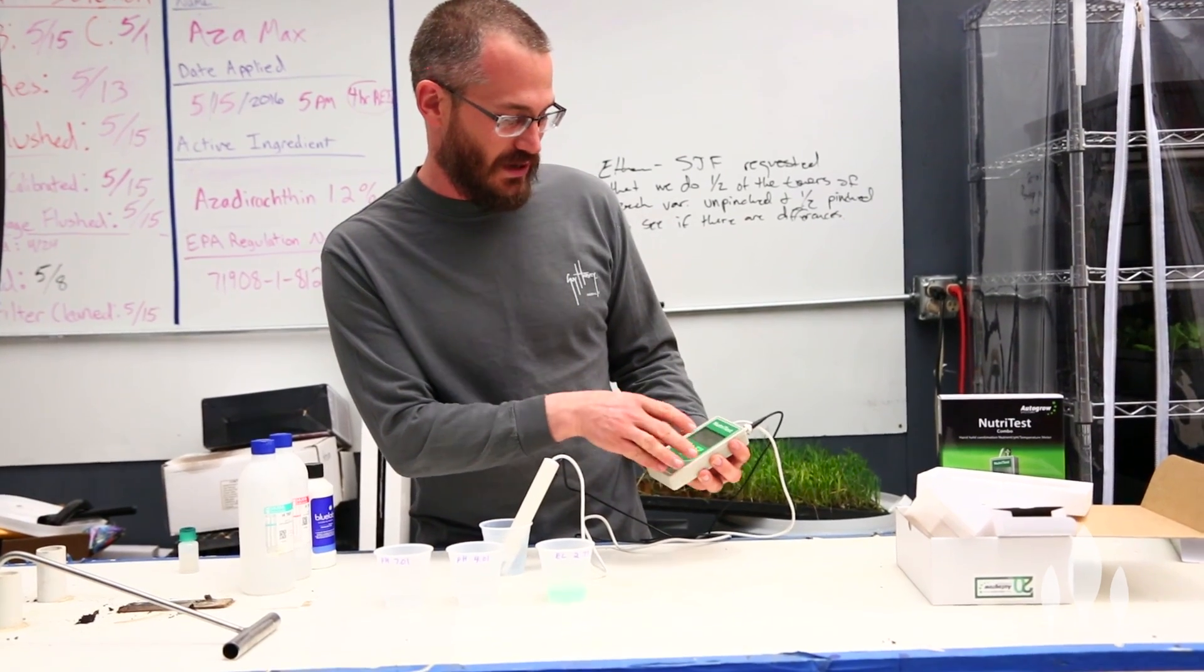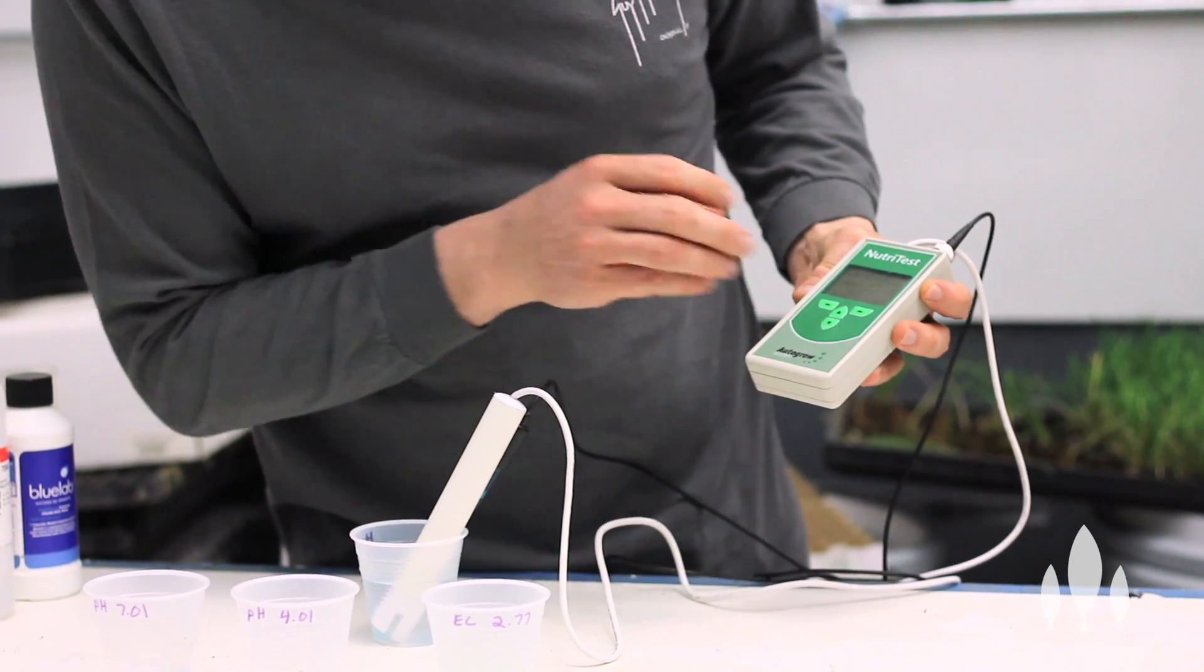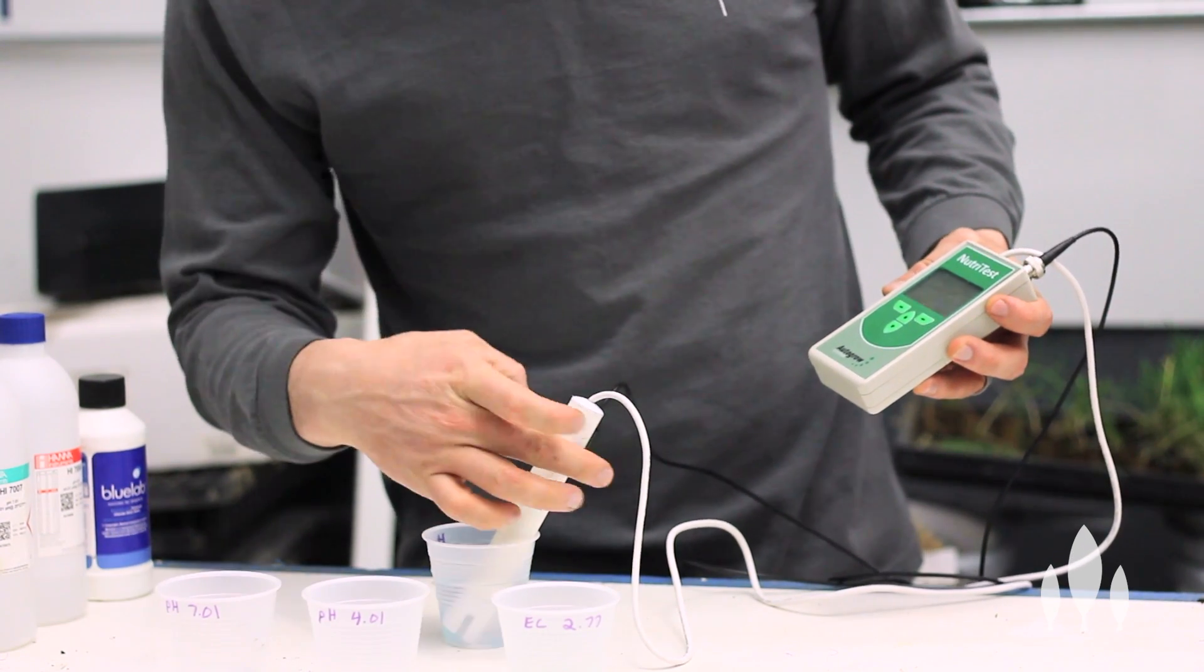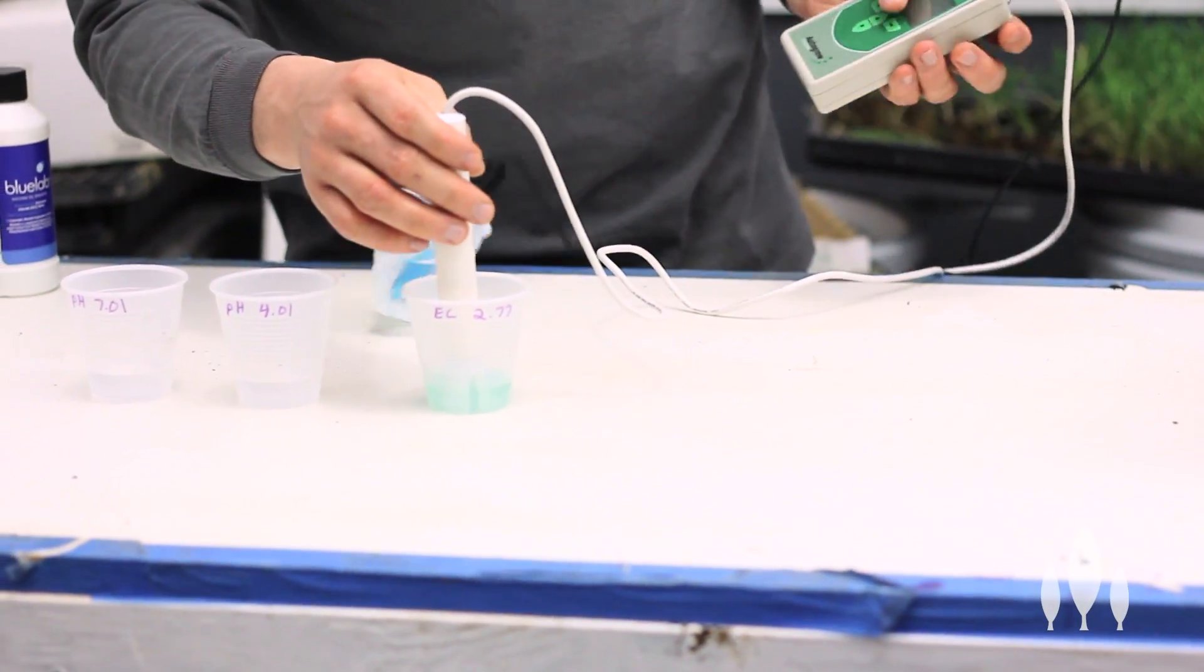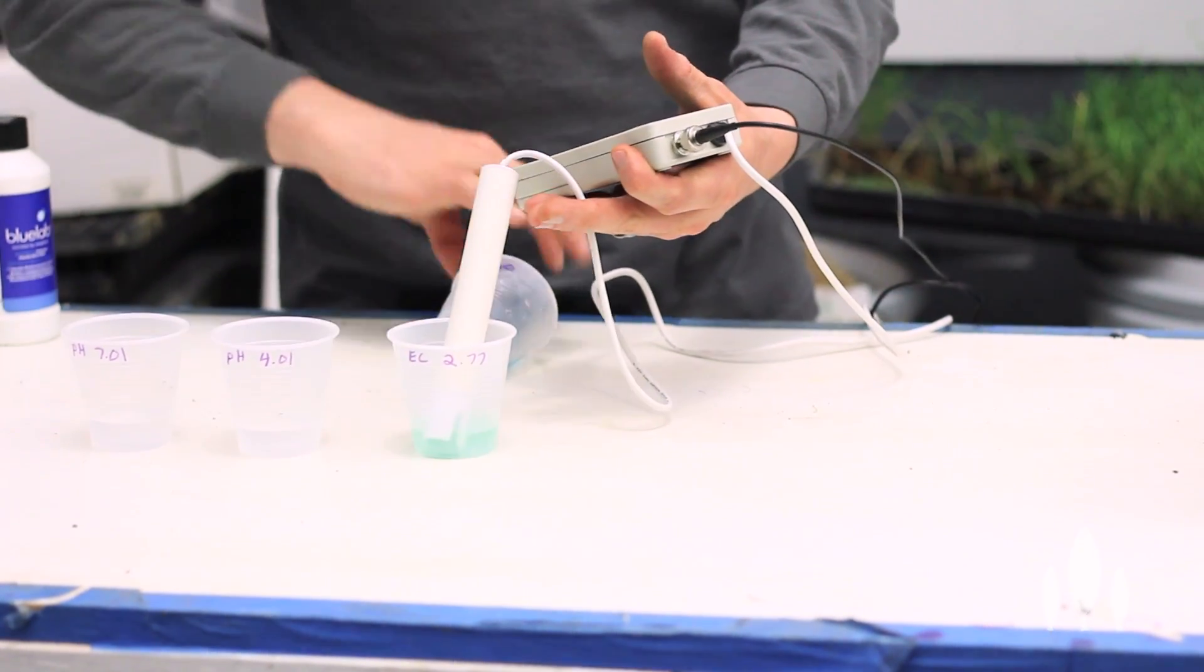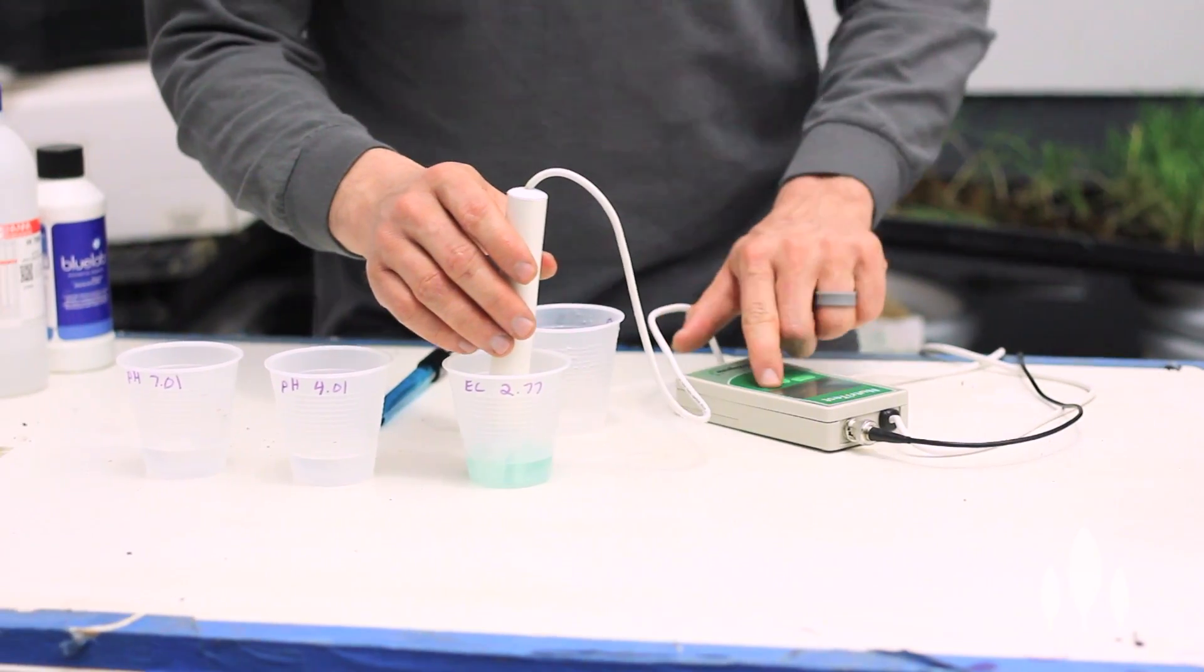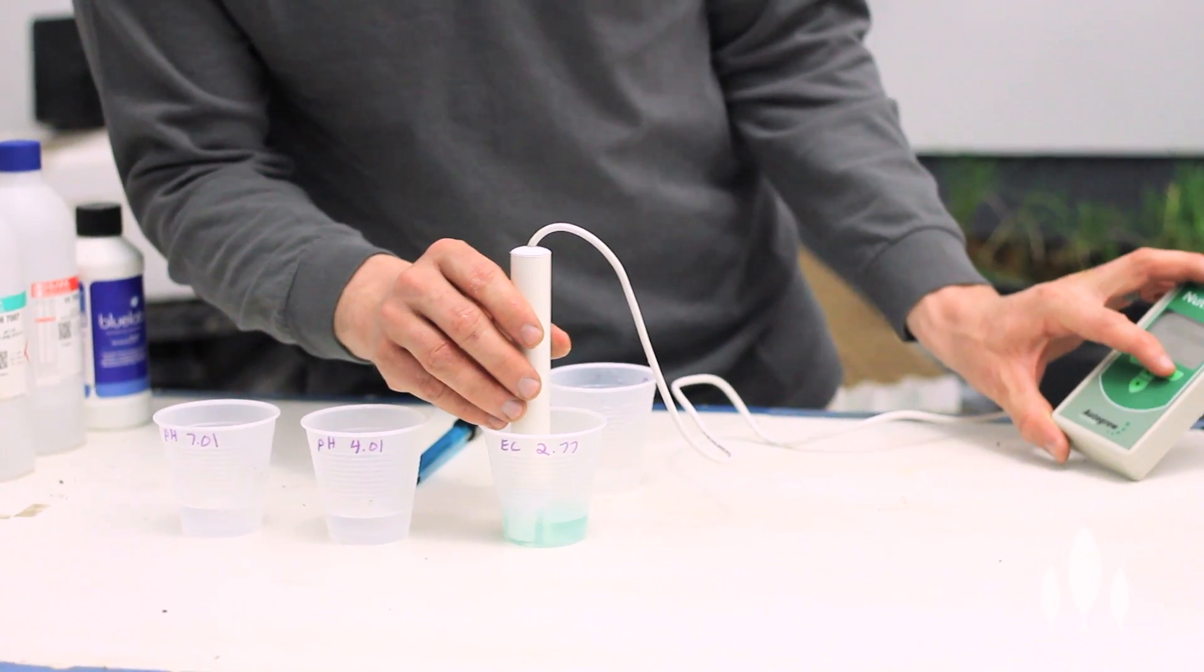So, to do this, we just hit menu, calibrate, we hit select, EC, select. It's going to say buffer, 2.77, press up, down. And so, we're going to basically take our little EC probe out here, and we're going to stick it in there. This is why I hate calibration. Chris? What did you put it in? I put it in an EC solution. So, this is a 2.77 solution of EC, and so it's in the buffer. Start calibration. We're just going to hit start.